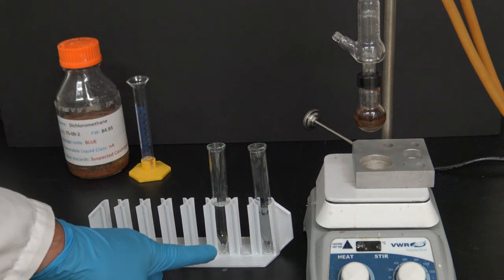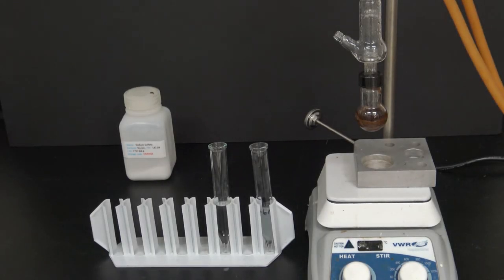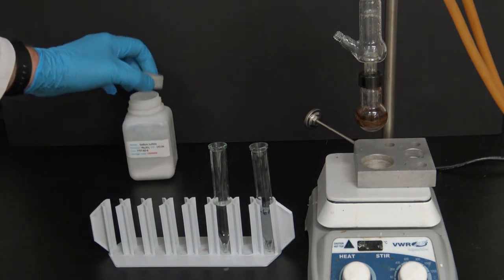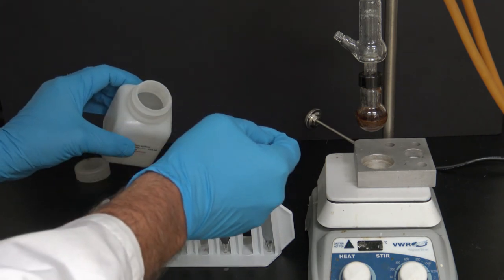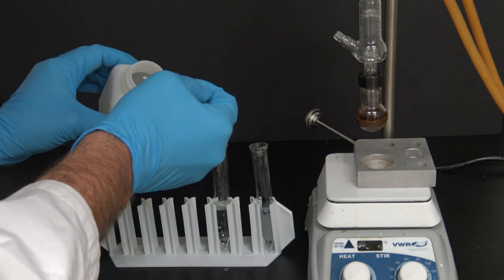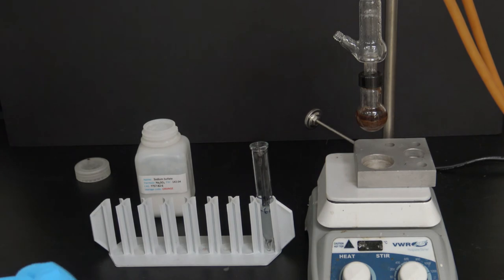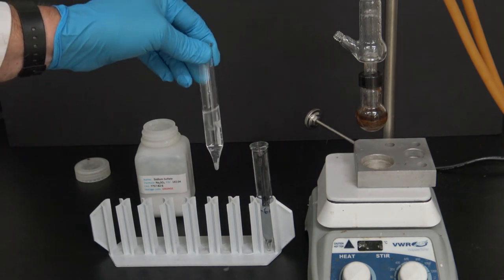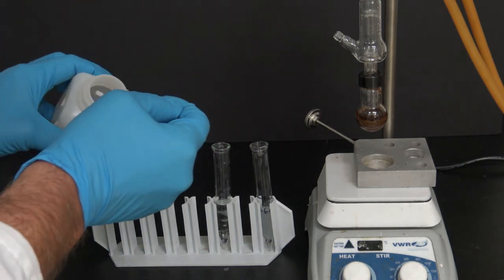This also might contain a little bit of water that I transferred over, so now I'm going to dry it in the same methodology that we did before, using some sodium sulfate to dry this compound. Here's my sodium sulfate. I'm going to take my small scoopula and add it directly into that test tube. And I'm going to mix that up a little bit. You can see it's sort of formed a blob down at the bottom, which means it's absorbing water. So I'm going to add some more.